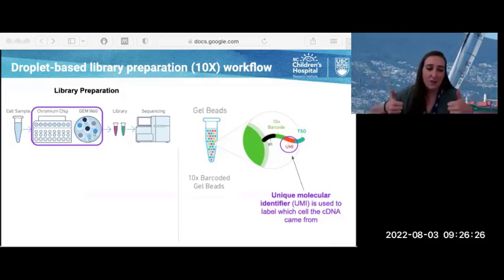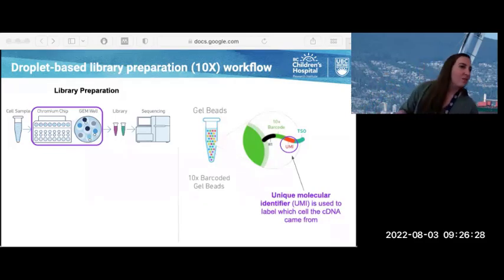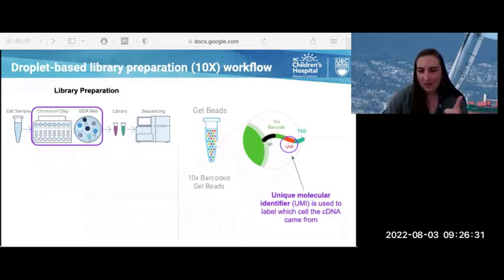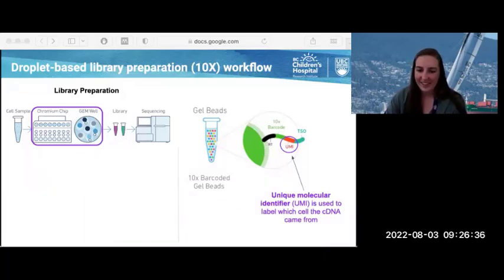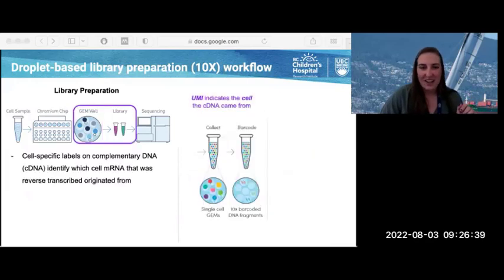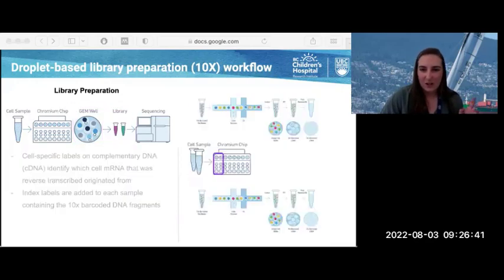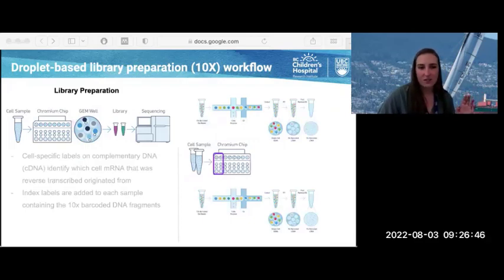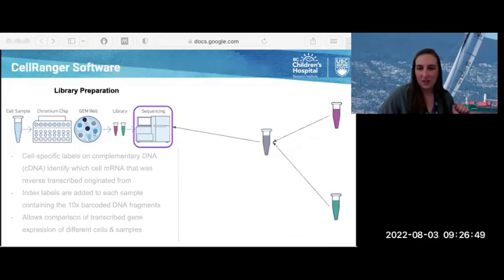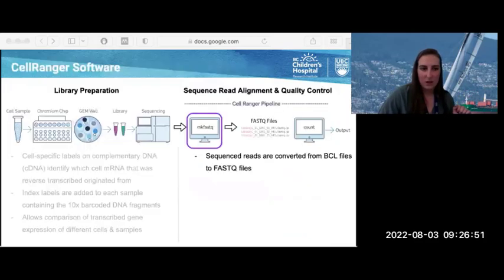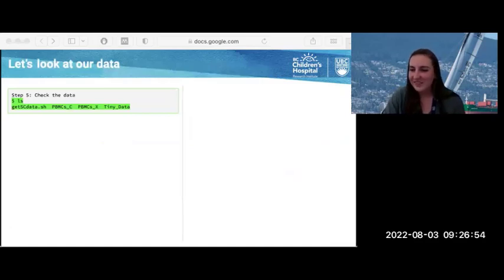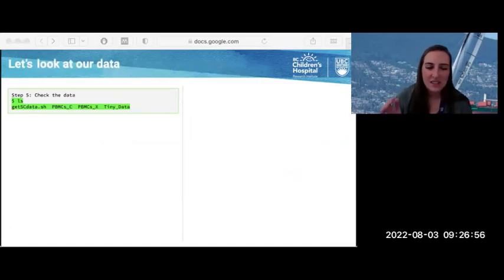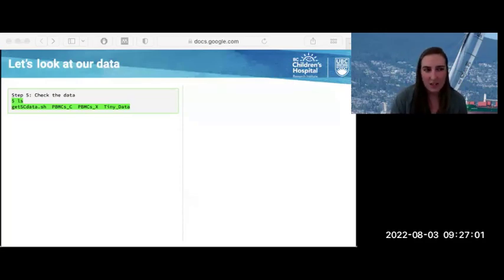Thumbs up if everyone's data is downloaded. Once you've moved into the single cell RNA sequencing folder, check the data and make sure you have these three new folders that have appeared in your data directory. One of them is Tiny — this is a tiny BCL dataset put forth by 10x Genomics so you can test their functions with it. Tiny can't be used for the CellRanger Count pipeline as it's too small, but you can still use it to test your script, and we're going to do that — we'll use it to test MakeFastQ.